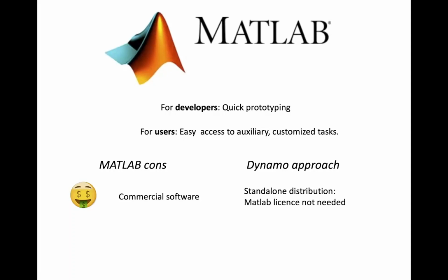But in any case, here in Dynamo, we offer the standalone distribution. We compile Dynamo against the MATLAB compiler system, meaning that we need a license in order to write and to compile, but the end users, if they want, they don't need to see MATLAB in their systems at any moment. They can even do scripting against the Dynamo core without MATLAB.